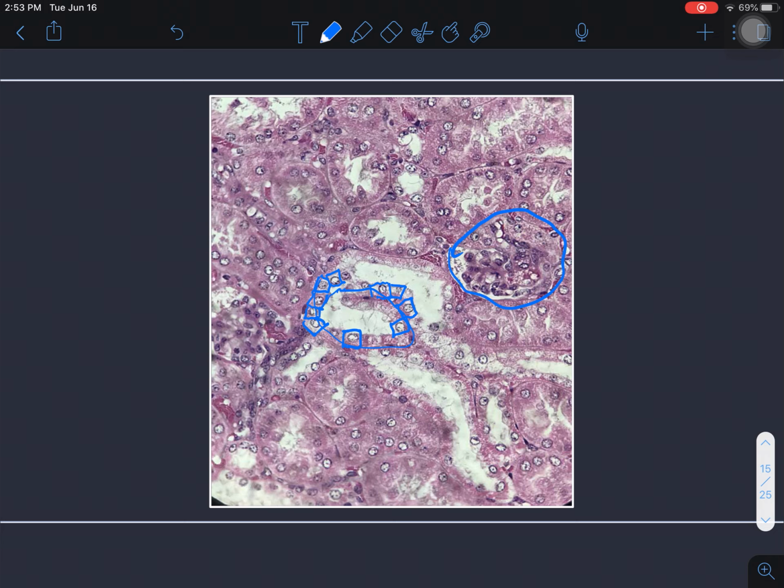And that's the easiest way to tell them apart. Find this guy, and his outer wall with those flat cells will be the simple squamous. Find the big or sometimes smaller holes, right? Because all of these up here, these are also cuboidal. That's just the hose cut through the center. This is the hose or tubule cut slightly at a diagonal.